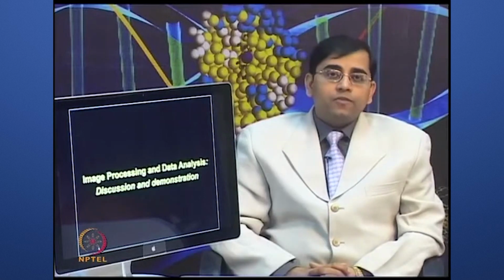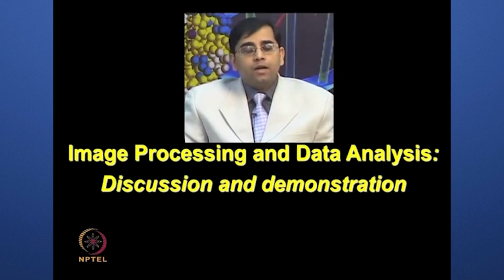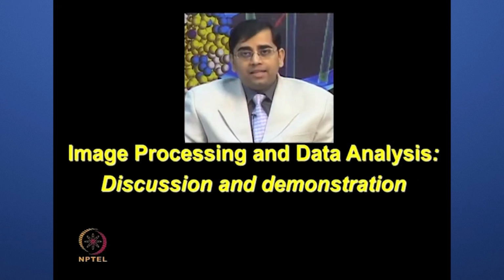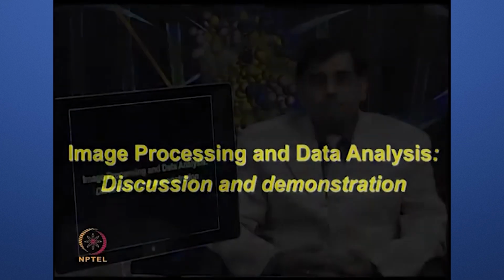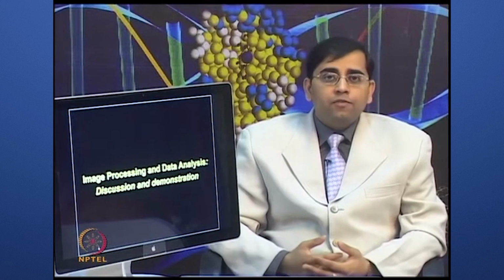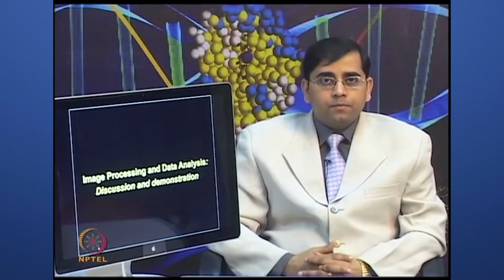So, during this course of discussion, we will talk about a stepwise procedure, how to take these scanned images, the raw TIFF files, and then align those, make the match sets, followed by spot detection and various types of manual refinement for image processing. And at the end, we will discuss how to obtain meaningful information by using various statistical analyses.